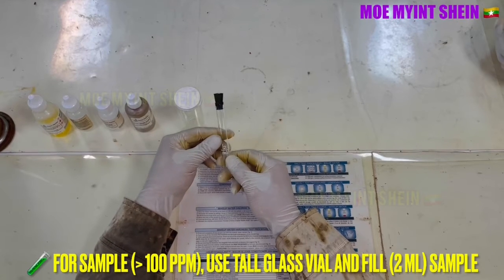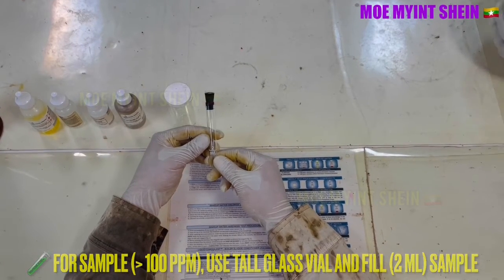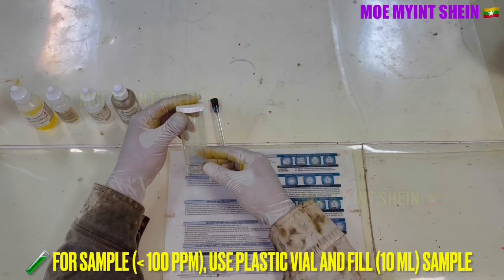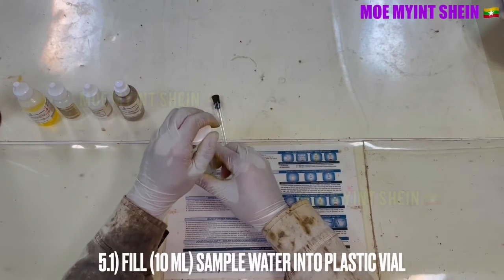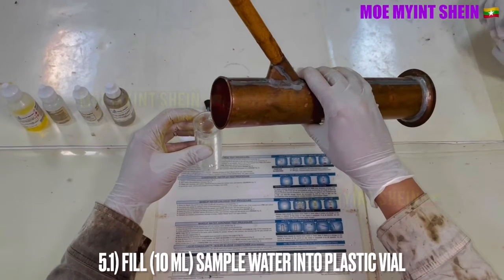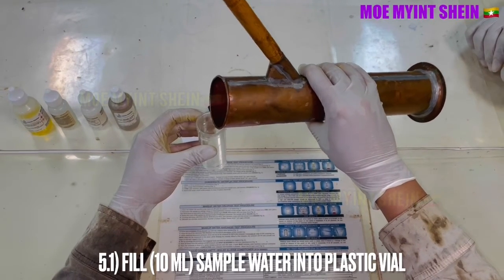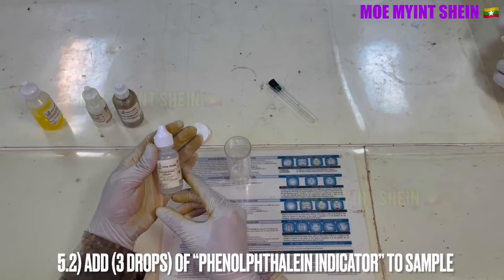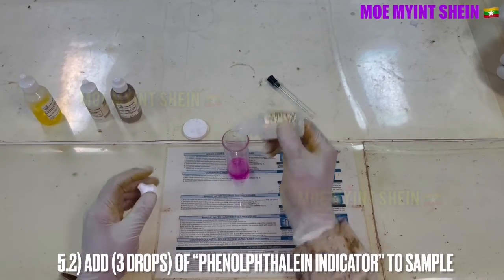The fifth test is the chloride test. If you think chloride PPM may be higher than 100 PPM, use the tall glass vial and fill 2 milliliters of sample. If you think chloride may be less than 100 PPM, use the plastic vial and fill 10 milliliters of sample. Add three drops of phenolphthalein indicator to the sample.